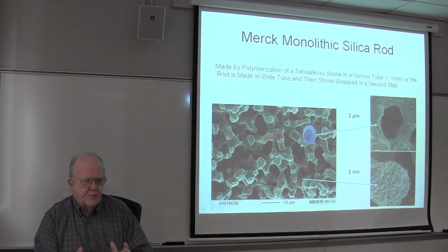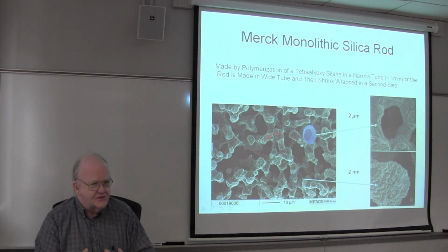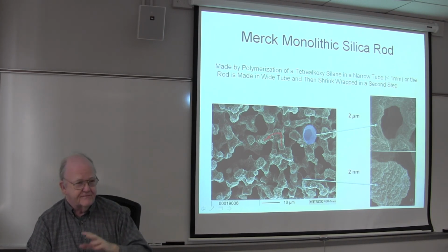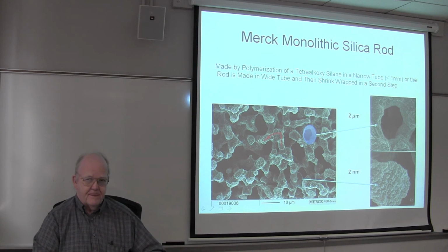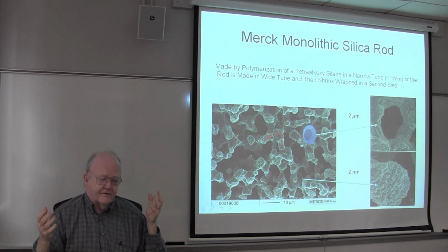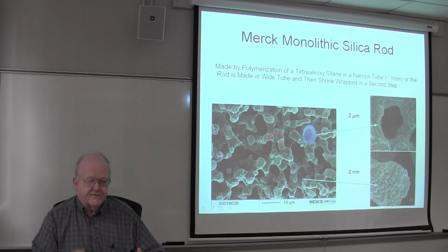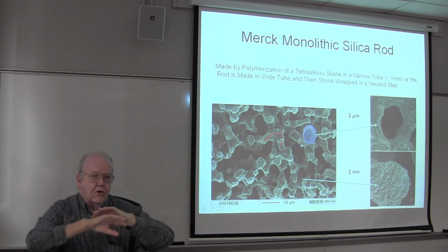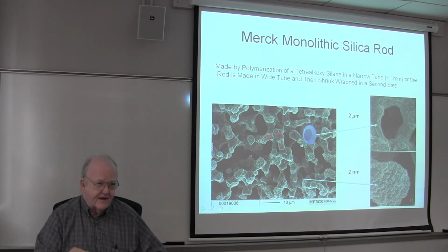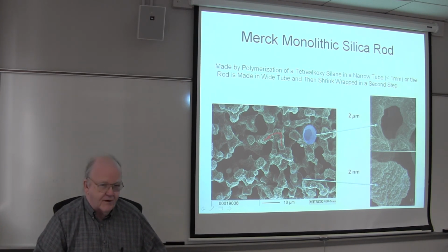There's only one store. You only got one shop to go to. And they don't make very many different chemically treated silicas with different flavors on the surface. Whereas there are something like 650 different reverse phases that you can buy from all the manufacturers put together. There's like 6 or 7 flavors of this stuff that you can buy.